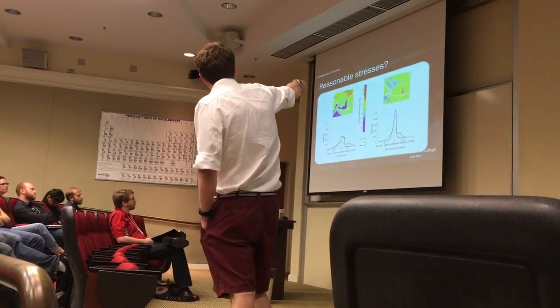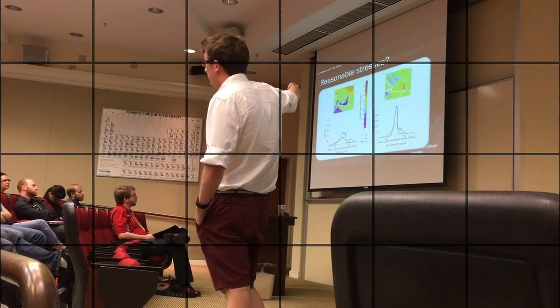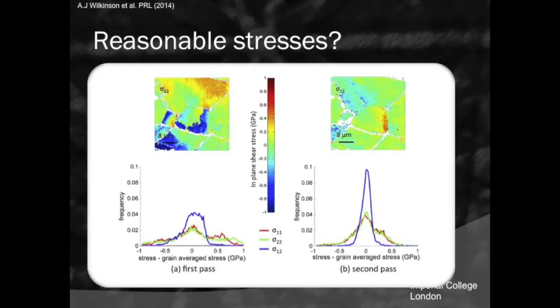Here is a demonstration that the remapping really works on a piece of copper. Within an elastic grain we shouldn't see sharp gradients in the elastic field. Without remapping, we see erroneously large stress variations. With remapping, the variations become much smoother within the grain, only getting large near grain boundaries where issues related to equilibrium and compatibility arise. We recover a much more reasonable range of stresses within the grain.